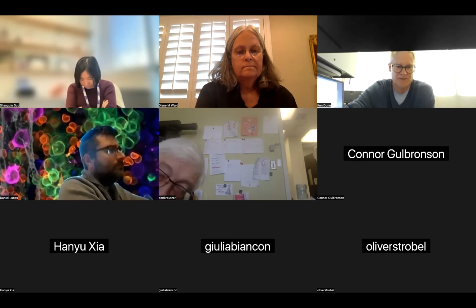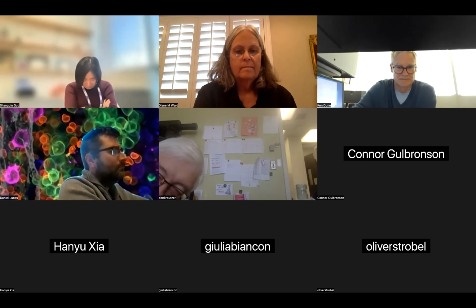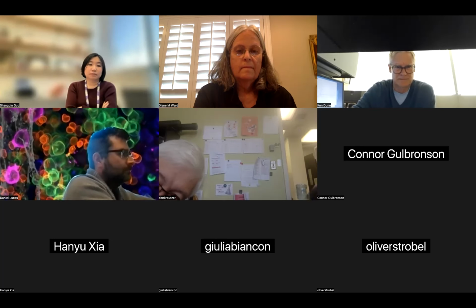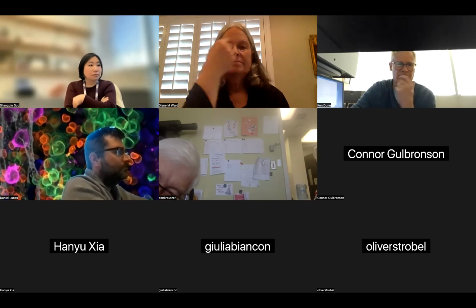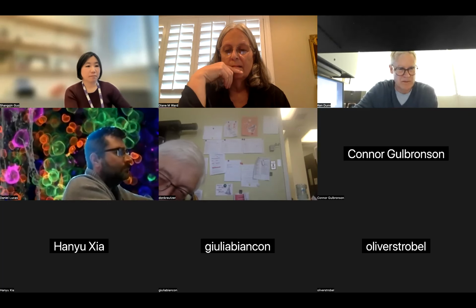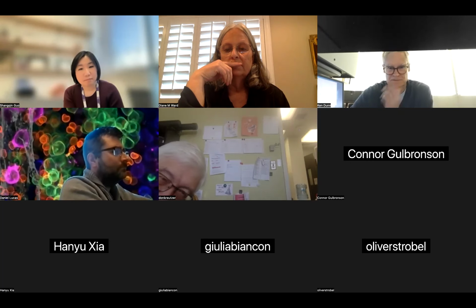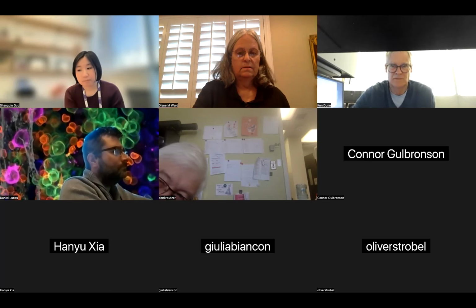Right, at this point, to be able to collect the tissue and put it on a slide and be able to image it in 3D, even if it was sequential, like day 2, day 5, to see the reactions by using probably either immunofluorescence or even mutant mice, knock-ins, knockouts, that kind of stuff to start with.